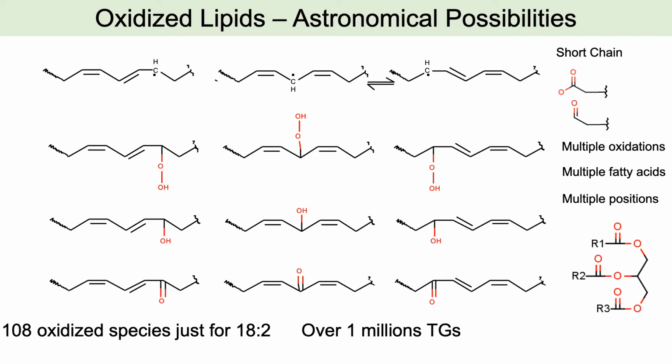An interesting note, just like we can't tell the isomers of different types of oxidations necessarily using traditional MSMS approaches and LipidMatch software, we also can't tell the position of oxidation on the fatty acid chain. For example, here you can see how different oxidations could occur at 3 different possible positions given 2 double bonds.